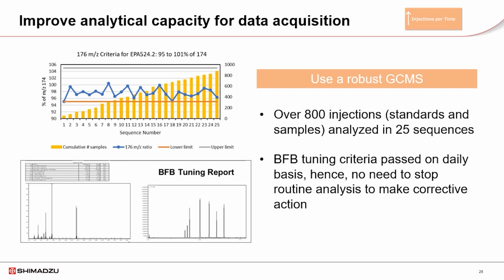So use a good pattern adjustment algorithm to meet the EPA requirement. It makes running the instrument without a stop possible. This is also important to analysis throughput. There are ideas to increase analysis throughput using cutting-edge GCMS technology.